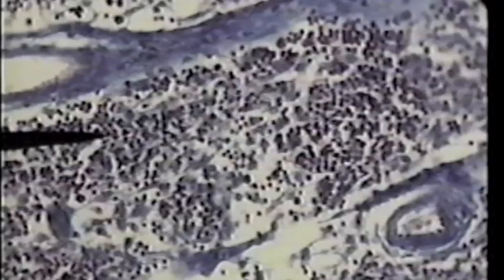Here is the lymph node on high power. We're not too worried about you recognizing that this is a lymph node, but you should be able to recognize this as reticular connective tissue. What tips you off is those bright blue fibers streaking across the field of view. The tip of the pointer is actually on a white blood cell that has been stained darkly, which we find within the lymph nodes. The reticular connective tissue serves as a structure, a framework, or scaffolding for these other cells.